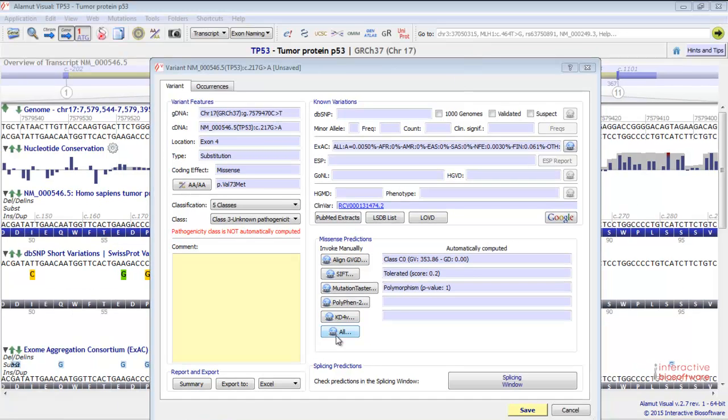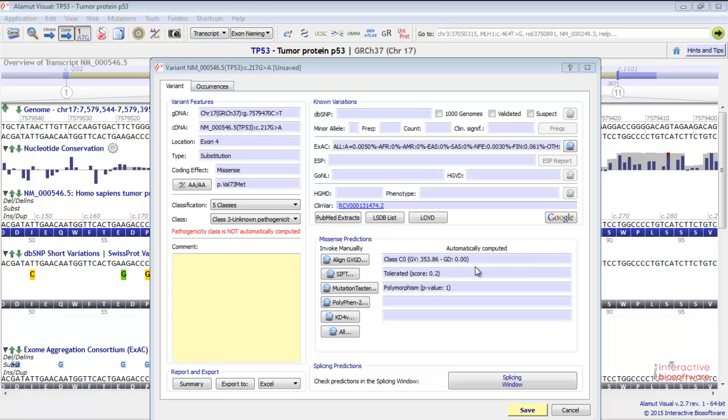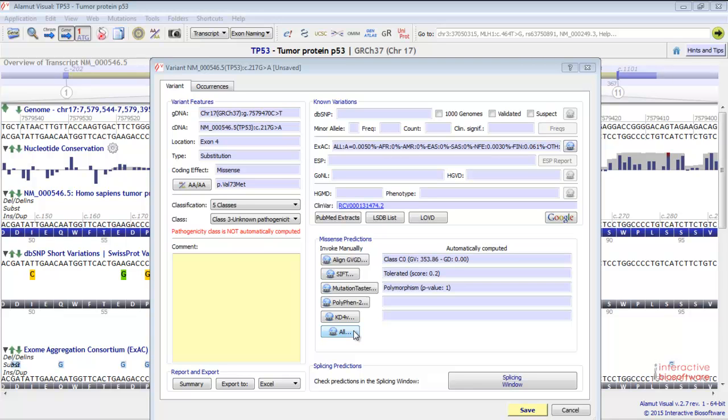Here you have the missense predictions algorithms. Here are reported the automatically computed results for Align-GVGD, SIFT, and Mutation Taster. You can click this button to open all the windows at the same time and directly access the missense predictions websites. You can also access each missense predictions website separately by clicking on the tool button directly.